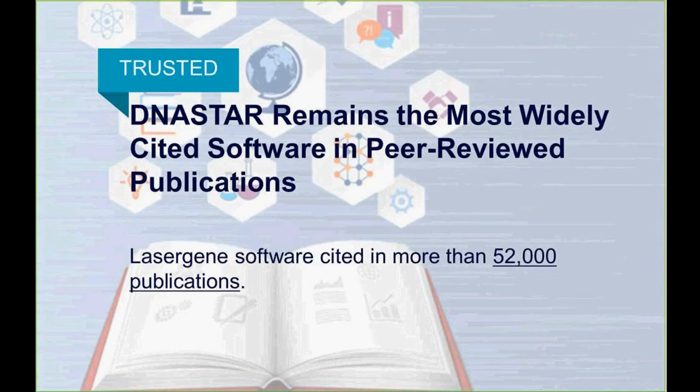Our attention to detail and over 30 years of experience in this field has resulted in a tool that is widely accepted all over the world. We are proud to be identified as the most widely cited bioinformatics software in peer-reviewed publications. At last count, our solutions have been cited in over 52,000 instances.